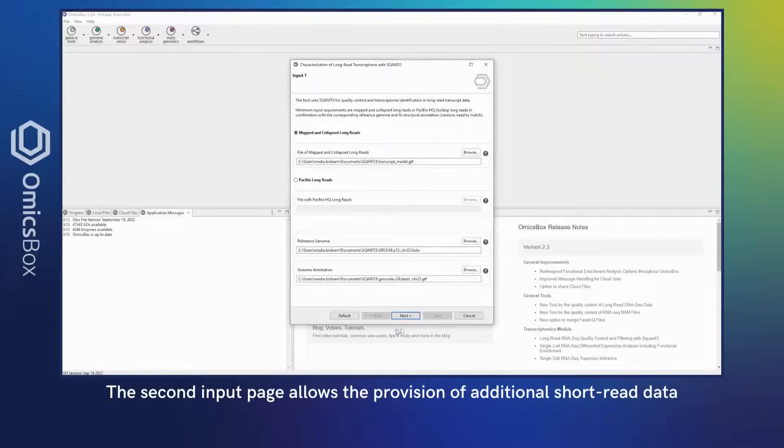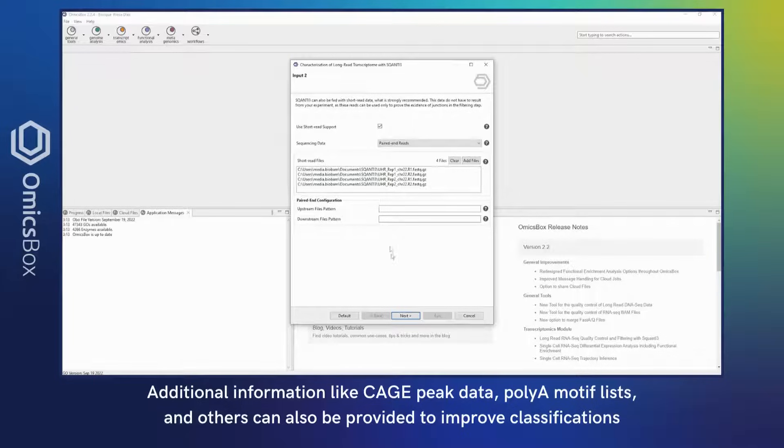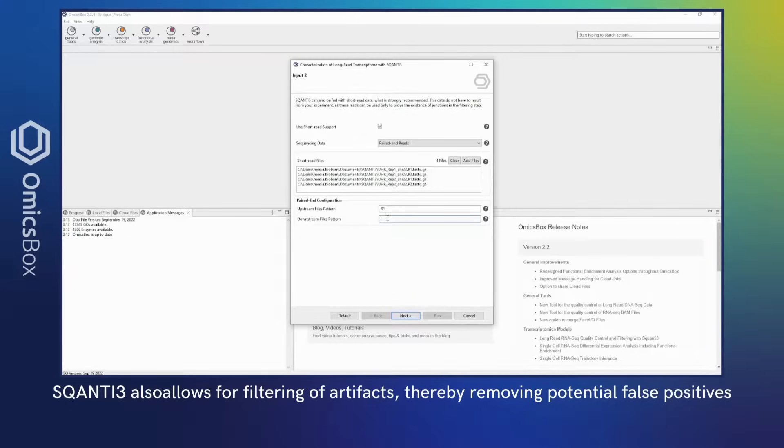The second input page allows the provision of additional short-read data. Additional information like cage peak data, polyA motif lists, and others can also be provided to improve classifications.